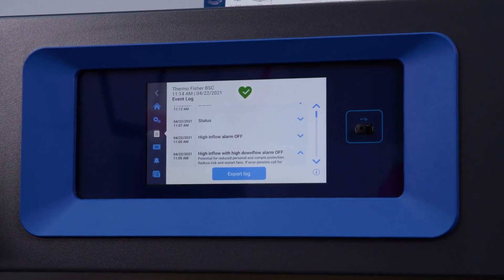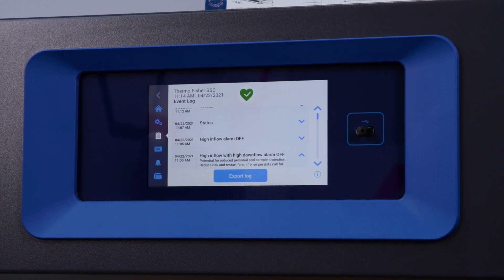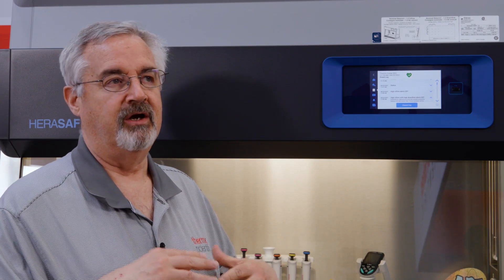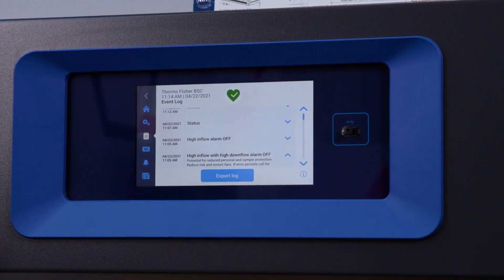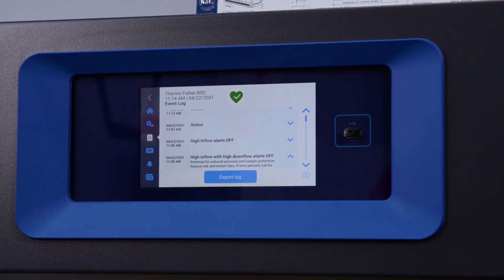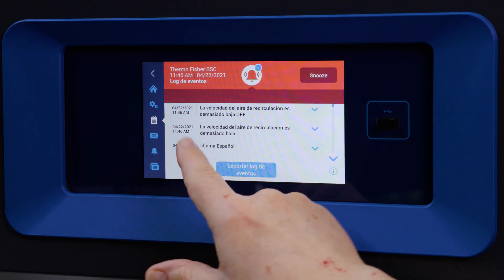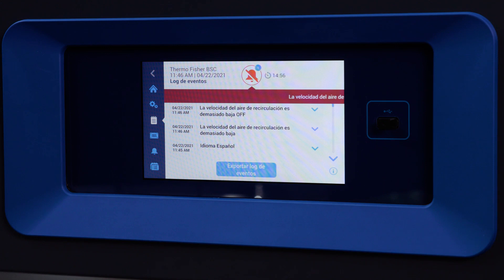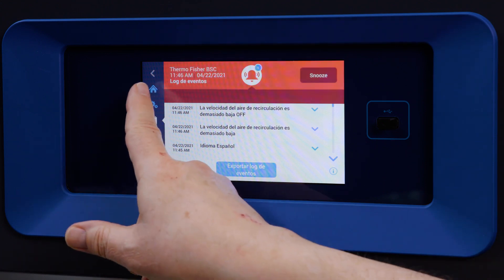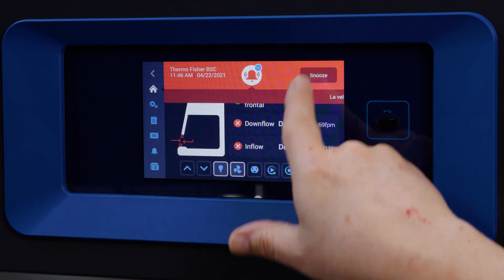Another advantage of the event log is that it's exportable. For facilities that have regulatory requirements where they need to monitor and record the events that happen with their equipment, you can export the log to a USB memory stick on a periodic basis. This full-text messaging is encompassed in the language selection, so not only will it tell you in English, but you can have it set for Spanish, French, or any one of the other available languages.